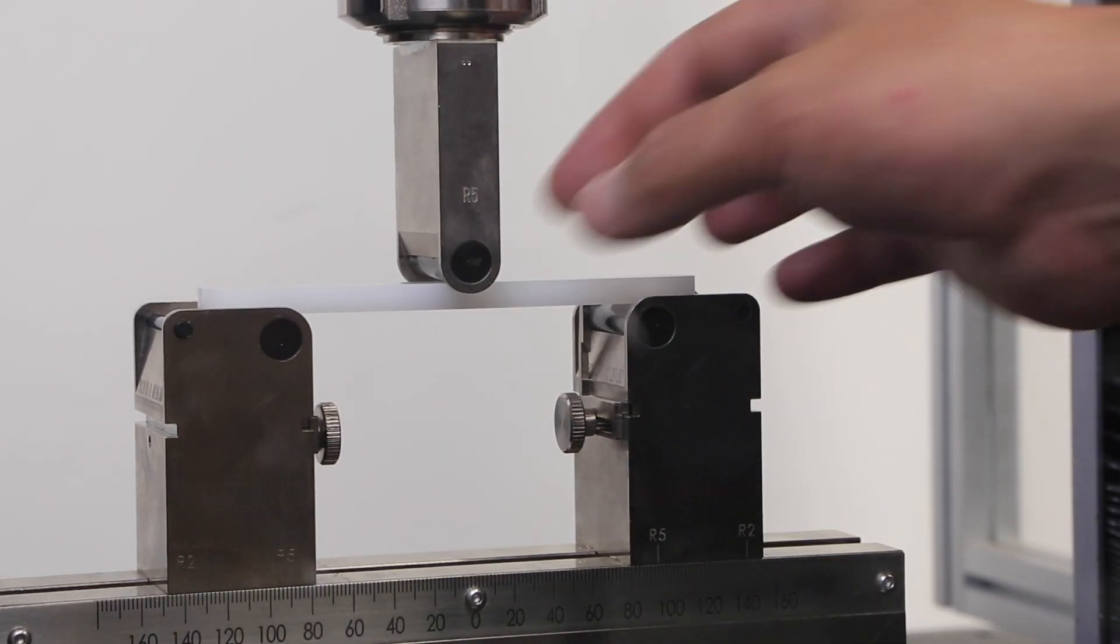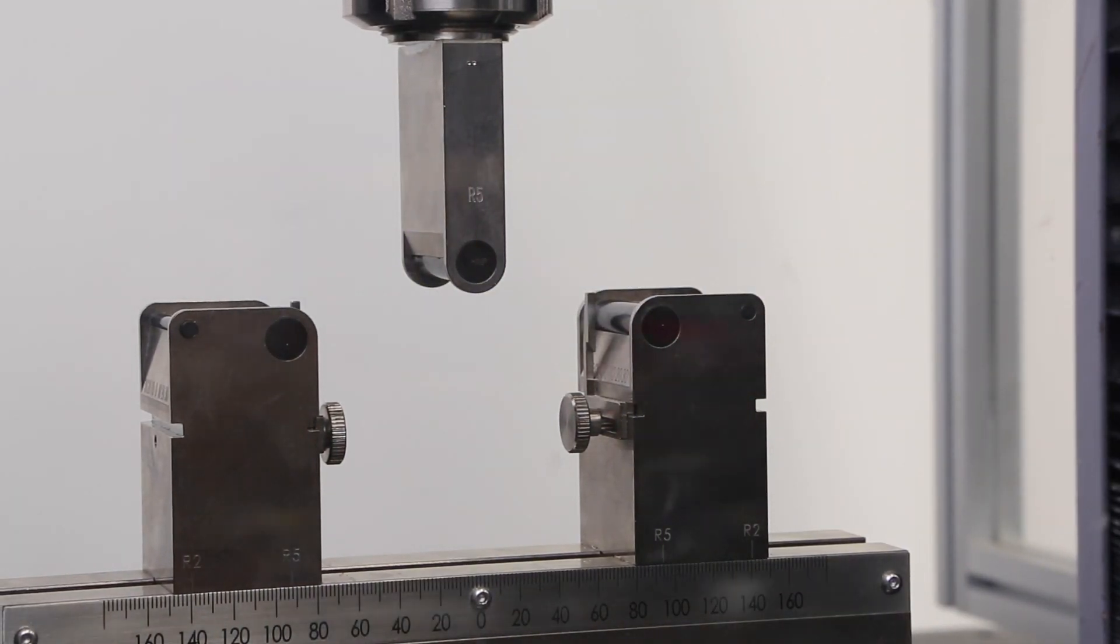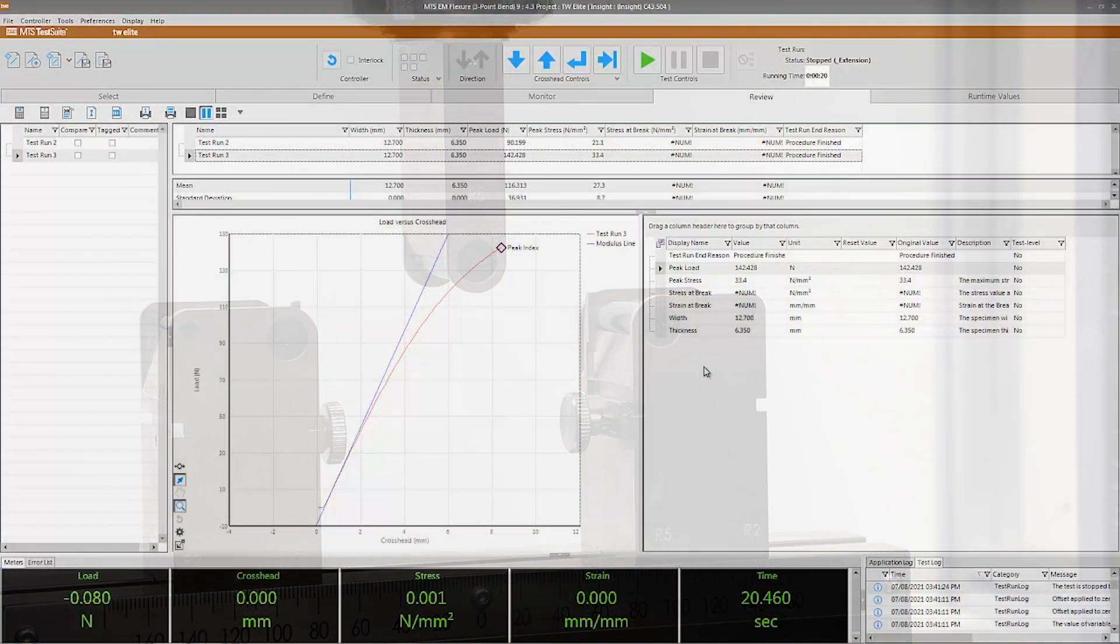After the test is complete, we can remove the specimen from the test space and return the load frame to its original position.